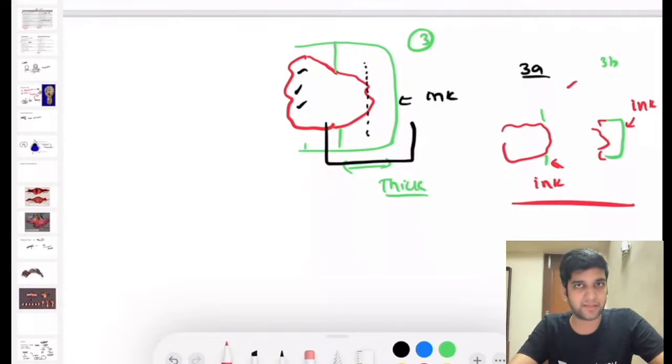Most of the hysterectomies done for endometrial cancer these days are simple hysterectomies. So first and foremost, while grossing, you ought to know whether it is a simple or Wertheim's hysterectomy. In which hysterectomy will you see parametrium? You will see parametrium only in Wertheim's hysterectomy, right? In a simple hysterectomy, you don't see a parametrium, right?